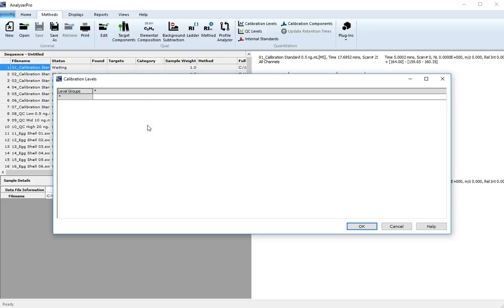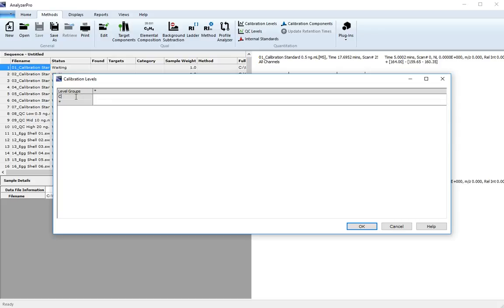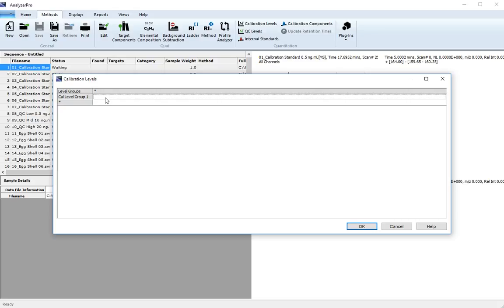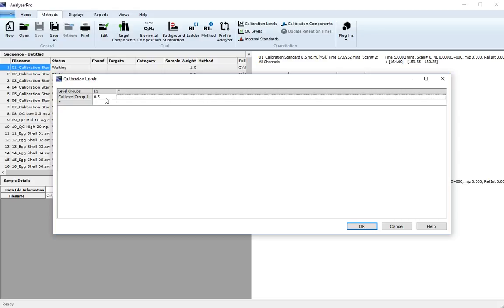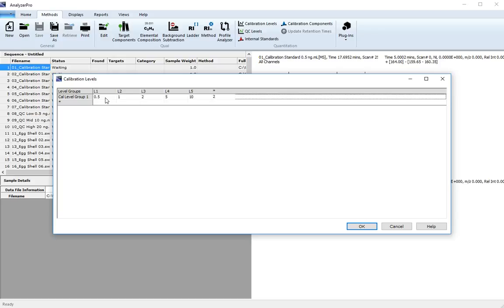The tutorial data contains the same seven calibration levels for multiple compounds. Therefore, we can define the levels in a single group. Name the group and type in the concentrations of each calibration level. Click OK.